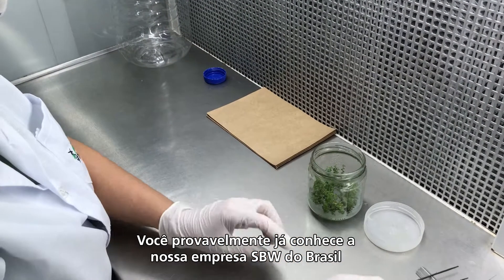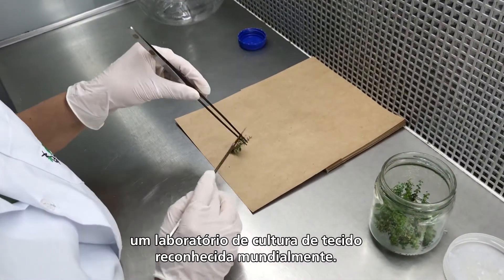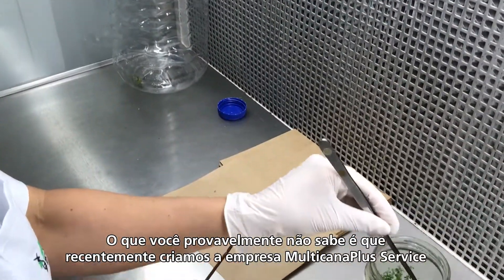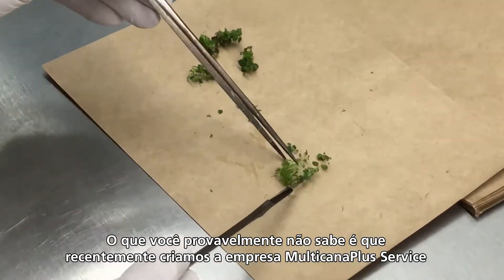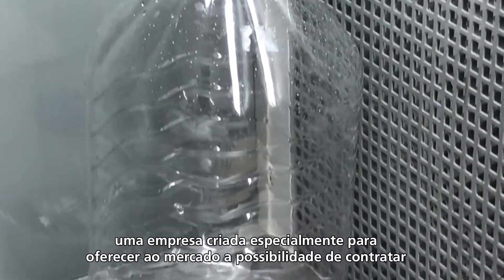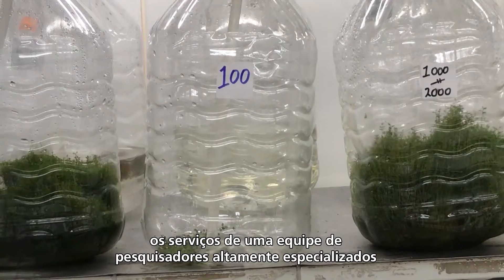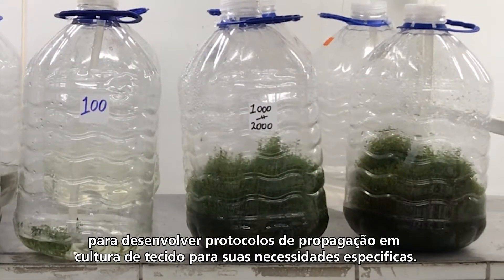You probably already know our company SBW do Brasil, a very successful tissue culture lab based in Brazil. What you might not know is that we just founded a new company called Multicana Plus Service, especially to offer the market the possibility to hire a highly skilled research team to develop tissue culture propagation protocols for your specific needs.